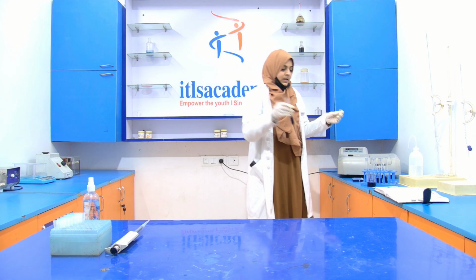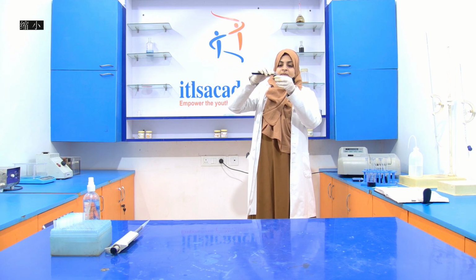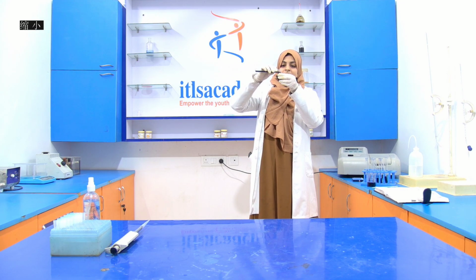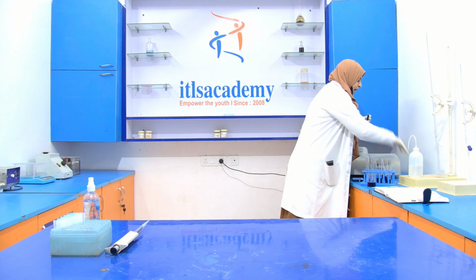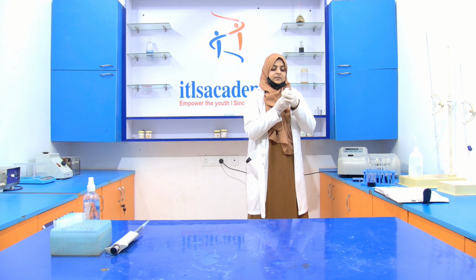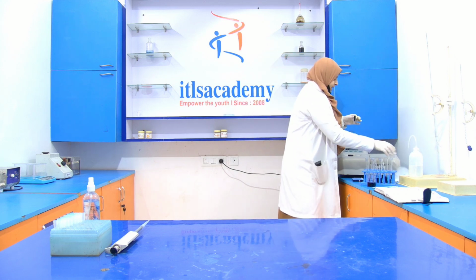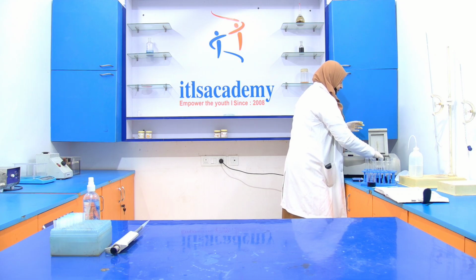Okay. Then transfer it into the cuvette. Wipe it with the filter paper. Then put it into the spectrophotometer.